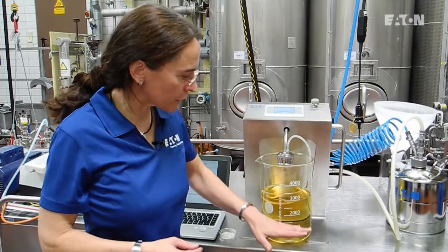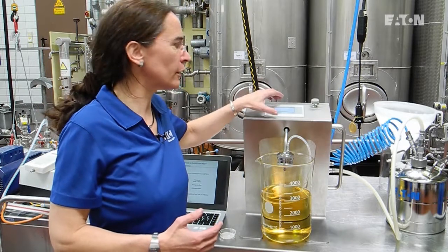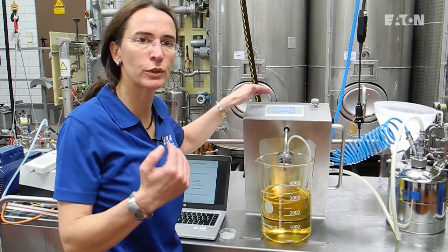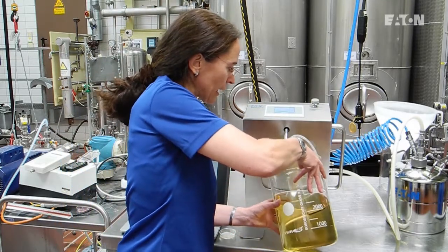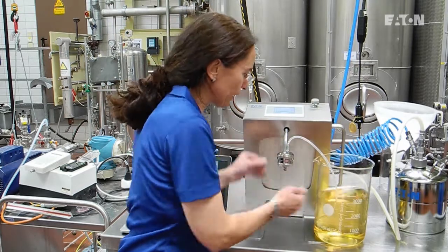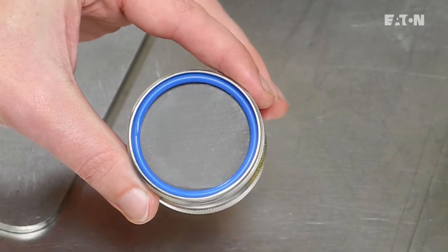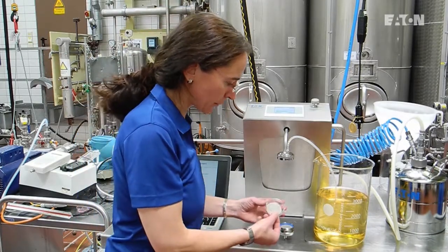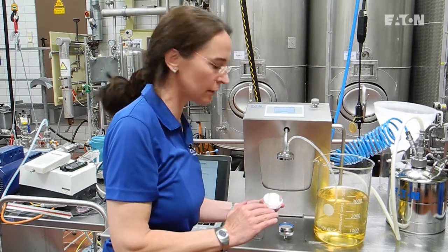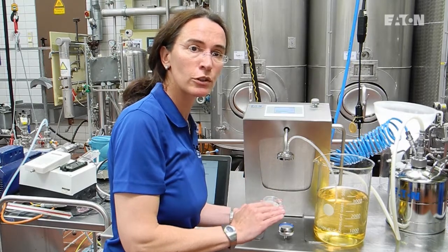The filtration is now finished. All three liters from the storage tank have been filtered through the membrane. On the display we see the F1, F2, and F3 factors, and we can also see that a good filterability is indicated. We can also show you how a membrane looks after filtration. As shown on the surface, there are no particles — it's a clean, nice surface. But that is not always the case; for example, here is a membrane with small particles or other substances on it, where the membrane is blocking and the result would not show good filterability.